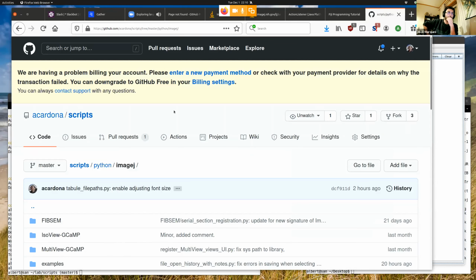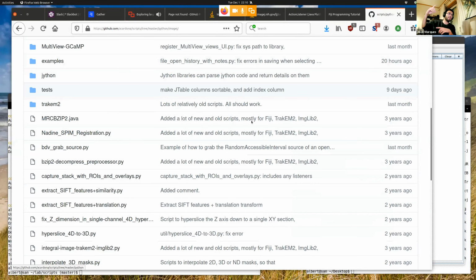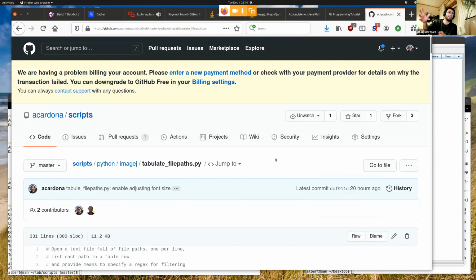Excuse me, just a quick question. When you were talking about the tens of thousands of files, could we in that preview add just a line below, for example, numbering the files that are currently on display? Would that be hard to do, or I'm guessing not? No, it would be very easy to do. Yeah, we could do that now if you want. It's a way to iterate.